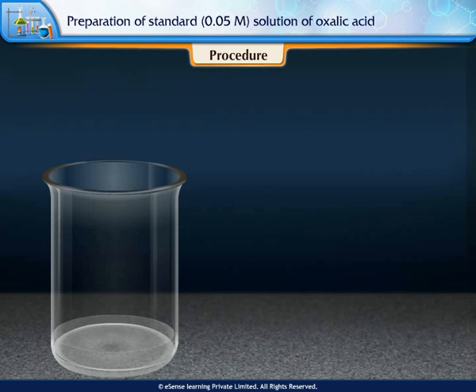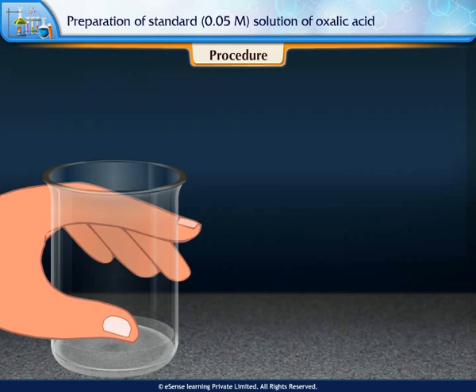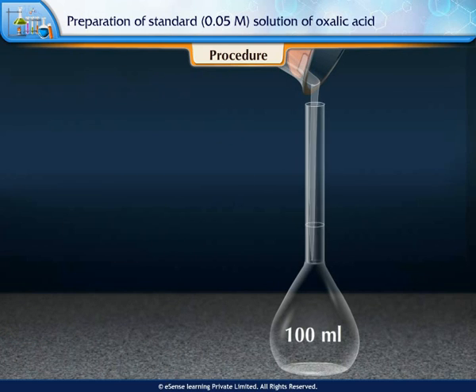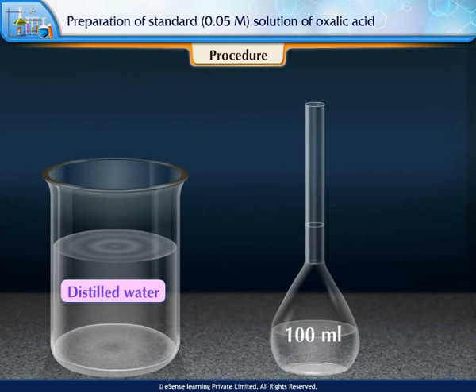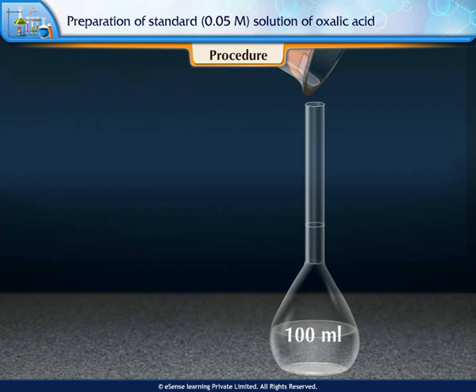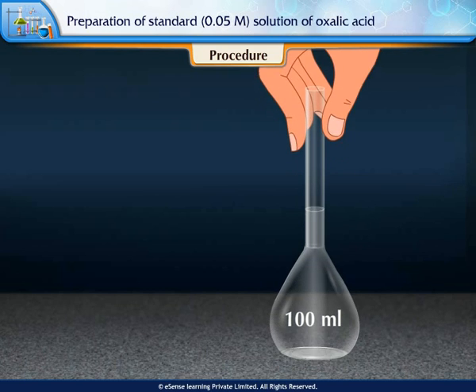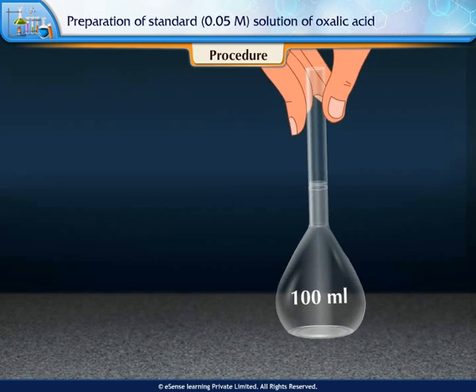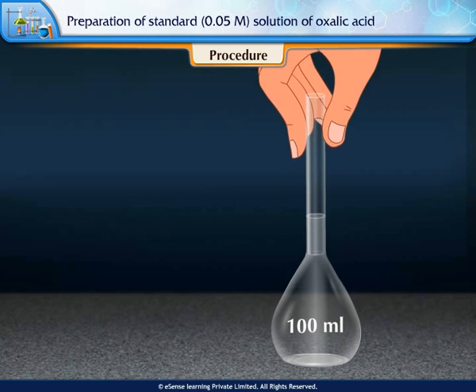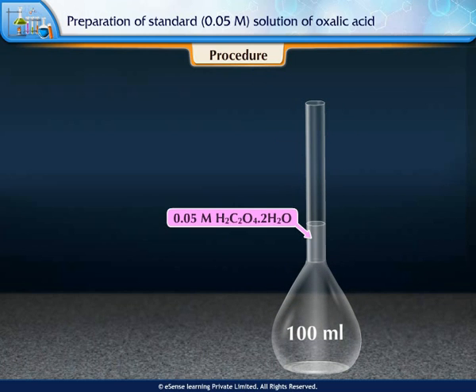Transfer this solution from the beaker into a clean 100 ml volumetric flask. Add distilled water carefully till the 100 ml mark. Shake well. The solution thus prepared is 0.05 molar oxalic acid.